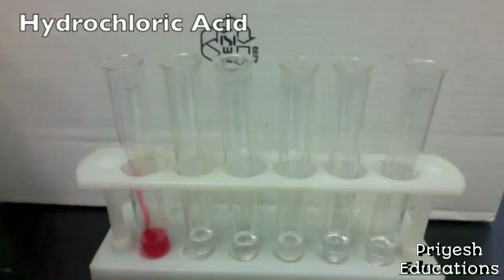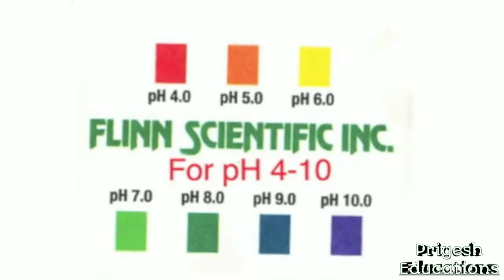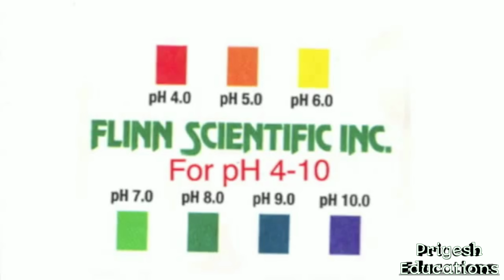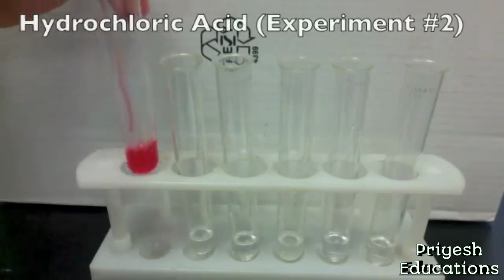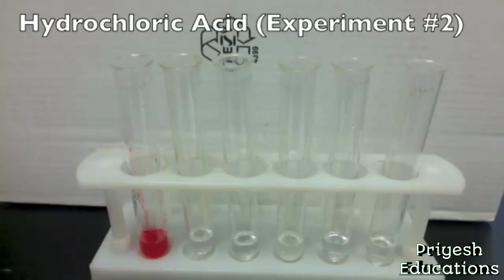and we look to see what color the solution turns. Here the solution turns bright red, so we can compare that to our chart and see that red corresponds to a pH of 4 or lower. That means we need to do further testing. It could be a 2 or a 1 or a 3.